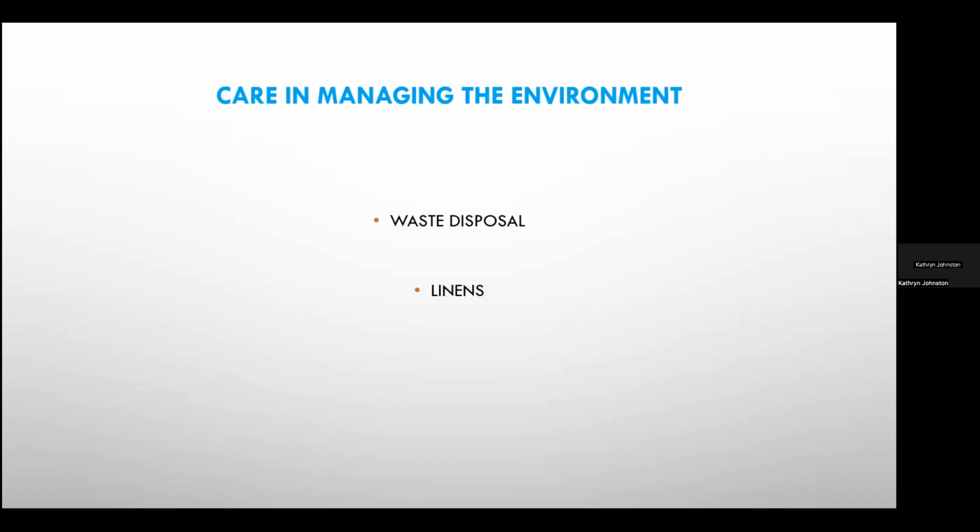So this includes things like paper, boxes, cardboard, packaging, and every disposable element that doesn't contain blood or biological liquids, including administrative waste. Excuse me. In the laboratory, you also have to be concerned with chemical waste. And this includes chemical products and anti-neoplastic drugs, although you wouldn't be managing anti-neoplastic drugs. And those have to be disposed of according to however your ministries of health or ministries of the environment have set that up.